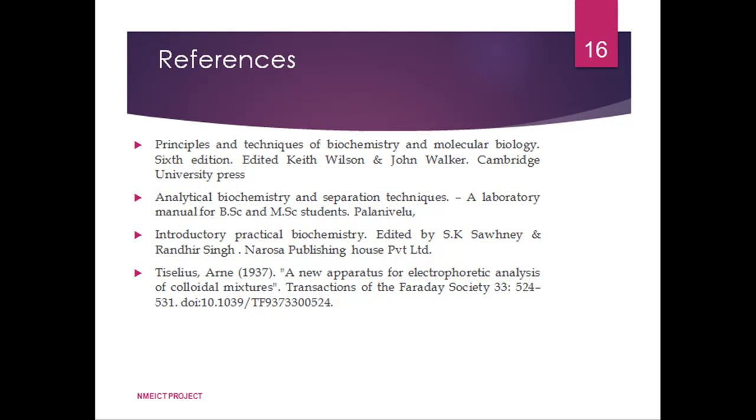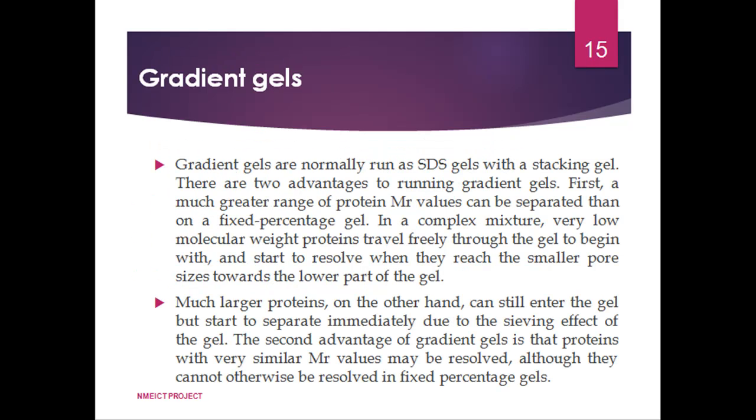What are the advantages of gel electrophoresis? Gel electrophoresis is used in different industries and research laboratories, for example in forensic labs, molecular biology labs, genetics, microbiology, and biochemistry. The results can be analyzed quantitatively by visualizing the gel with UV and a gel imaging device. The image is recorded with a computer-operated camera, and the intensity of a band or spot of interest is measured and compared against the standard marker loaded on the same gel. The measurement and analysis are mostly done with specialized software available.